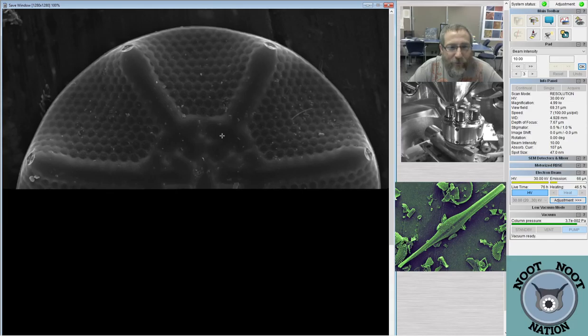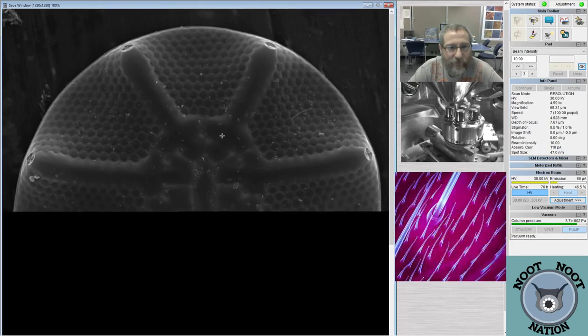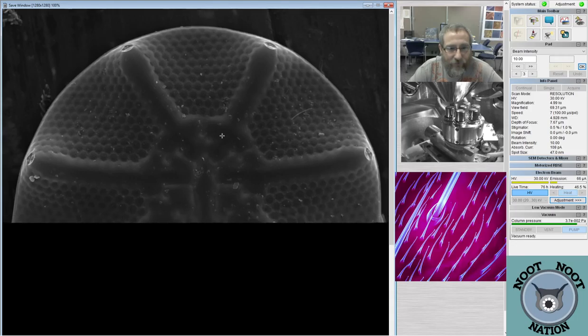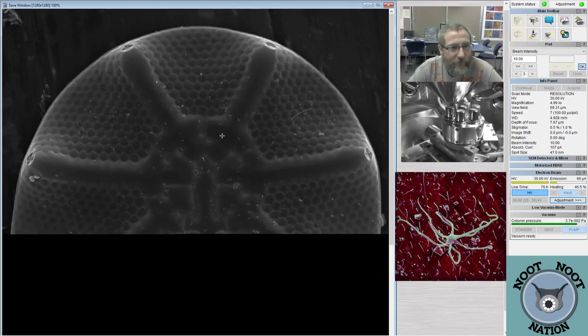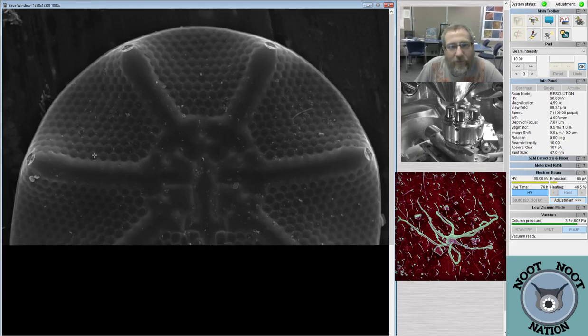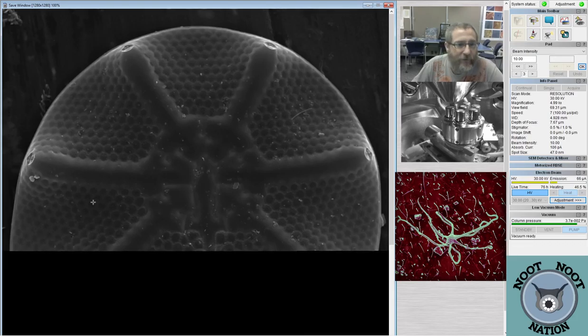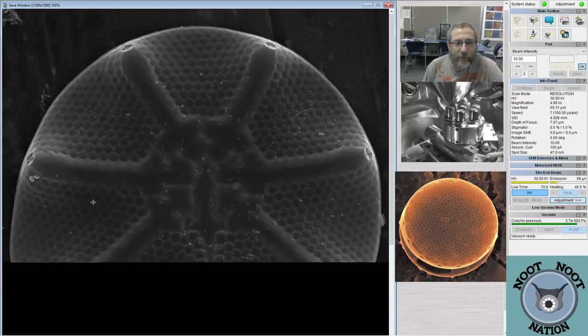Yeah, we really haven't seen very many good views of Asteropolis like this, where we could see all the external processes. Yeah, there's a beautiful one of the inside, which was pretty amazing. You did a drawing of that, too. It's on your Redbubble, right? It is. You can even see the pores right here, and over here. It's pretty nice. It is.